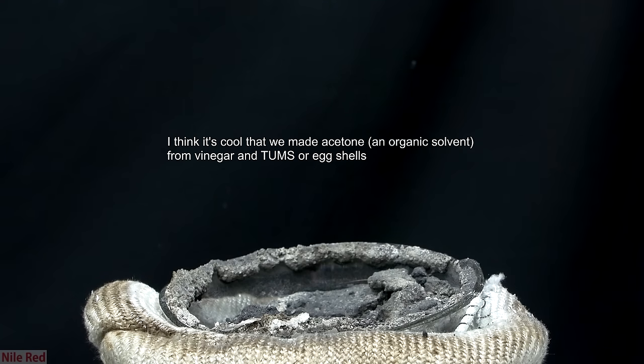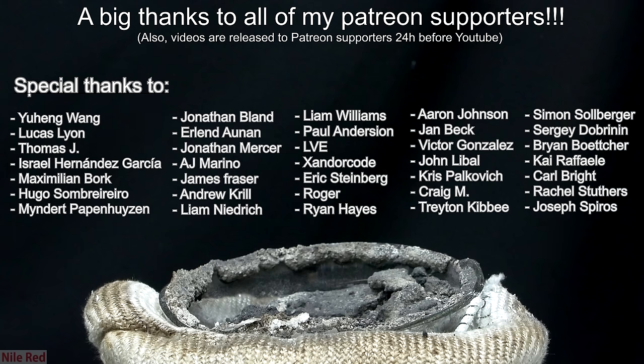Anyway, that's all I really have to say about making acetone from calcium acetate, and I hope you guys enjoyed. In general, I think dry distilling calcium salts to produce organic compounds is pretty cool, and I might explore this in some future videos.